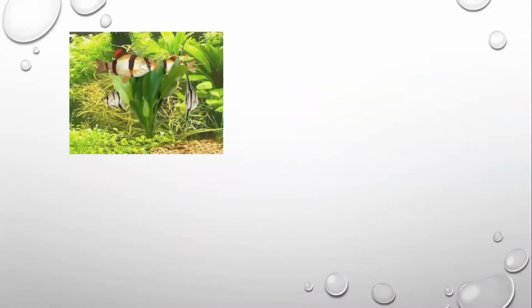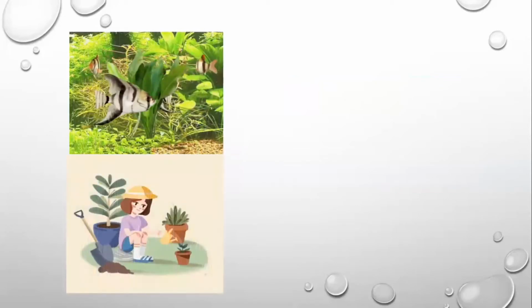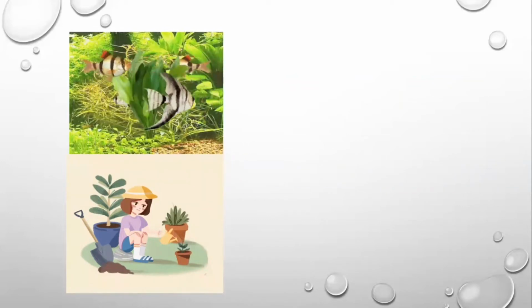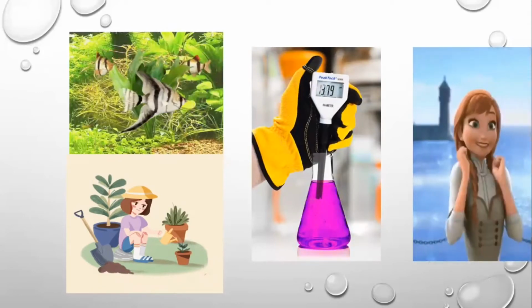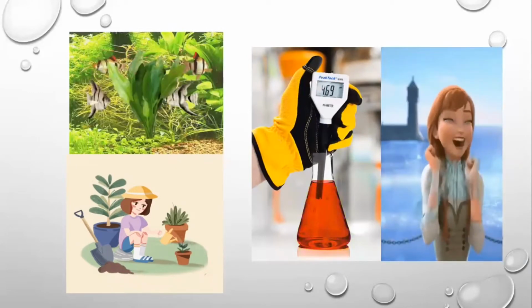If you keep tropical fish, for example, or you're a gardener with specimens that require soil of a certain acidity or alkalinity, getting things wrong with the litmus risks killing off your prized pets or your plants. That's why it is important to use a meter that can measure pH directly and accurately. So what are pH meters and how do they work? Let's take a closer look.